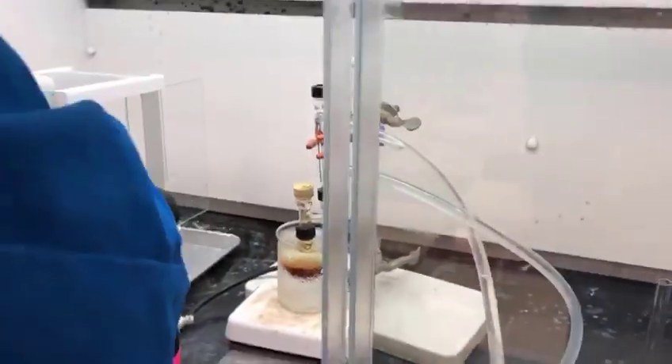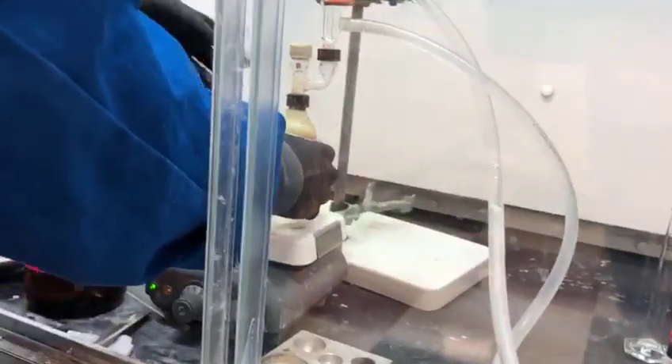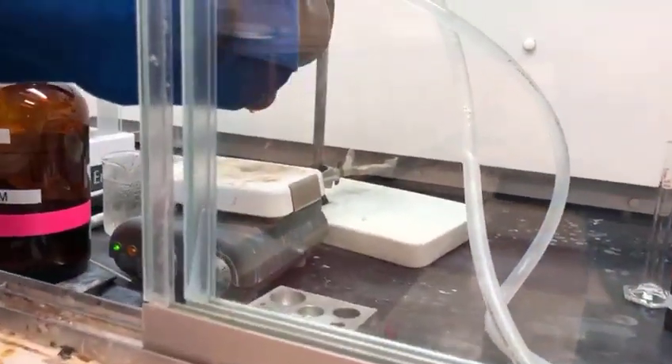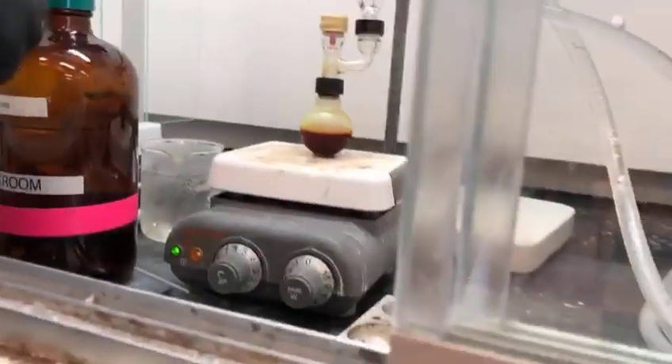At this time we are removing the ice bath since we have added all the I2, and we are going to allow our mixture of 1-hexene, iodide, and sodium borohydride to react for one hour at room temperature.